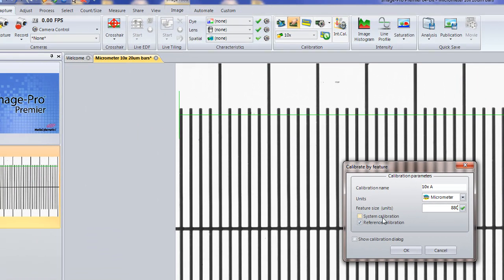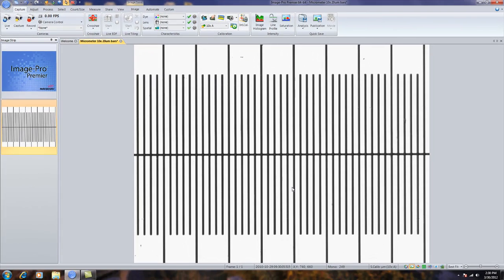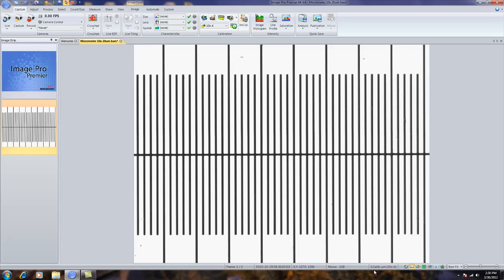Again, I'm going to create a reference calibration. By pressing OK, it will automatically create that calibration. You'll notice two things. The calibration, by default, will show up down here for whatever the current calibration is on an image. In this case, the 10xA.